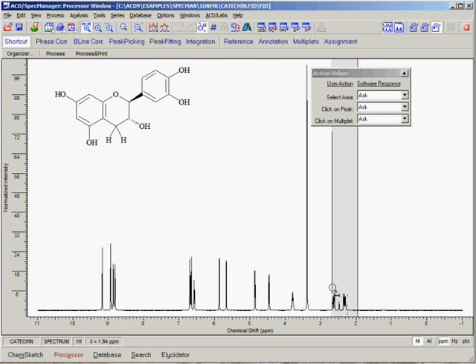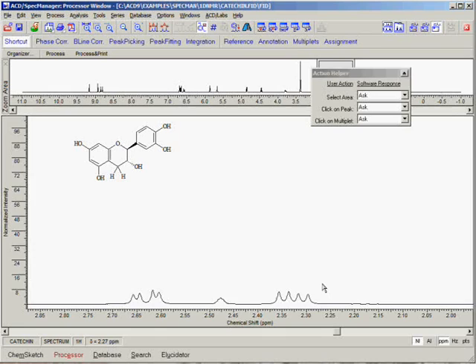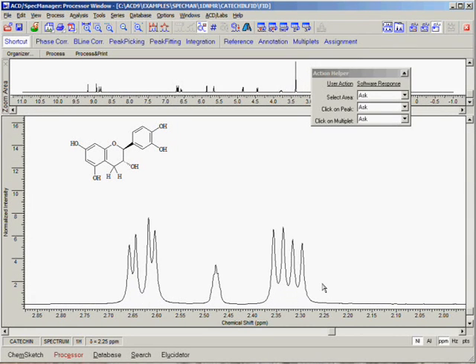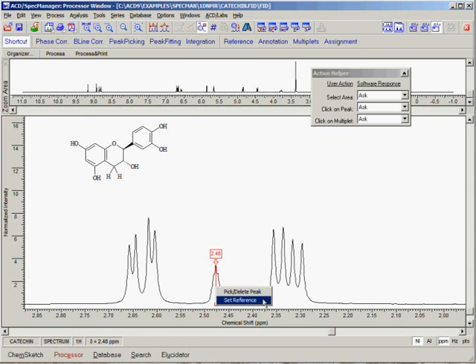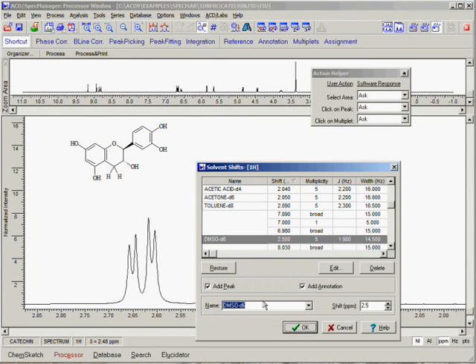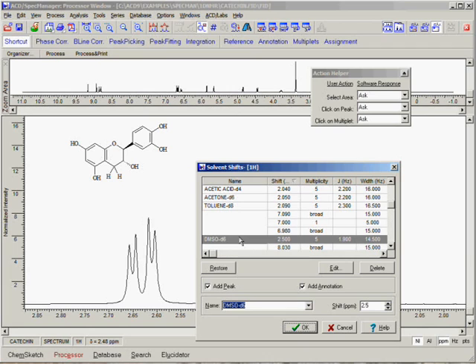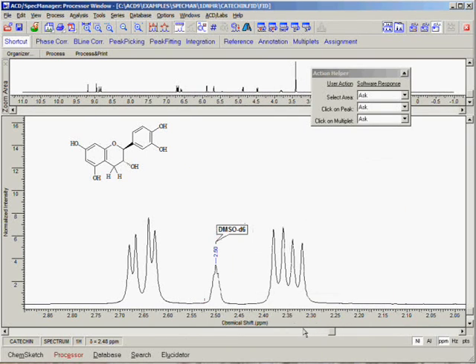We begin by zooming in on our region of interest. This can be done by clicking the right mouse button, followed by clicking and holding the left mouse button and dragging over the region of interest. We can now click on the DMSO peak and we will be given the option to either pick this peak or set the reference. Because we set all of the defaults in the Action Helper to Ask, the software will ask us which procedure we would like to perform. In this case, we choose Reference and the Reference dialog box appears. Since the solvent field in the raw data that we imported was set to DMSO, the software jumps to DMSO in the solvent reference table. Simply click OK and our spectrum is referenced.